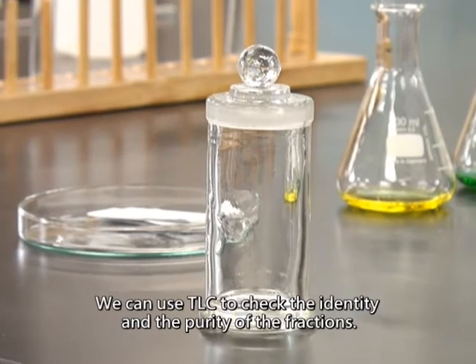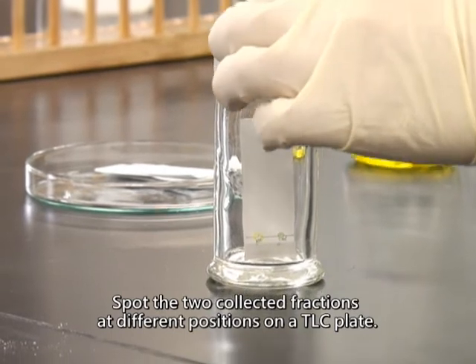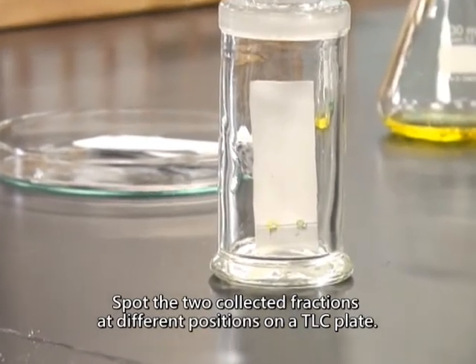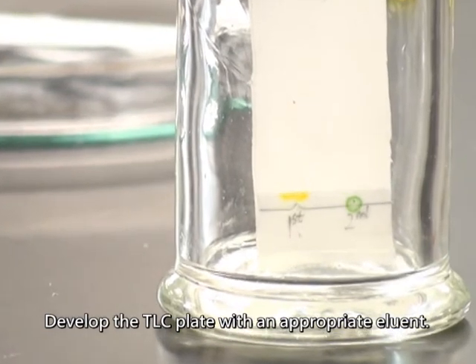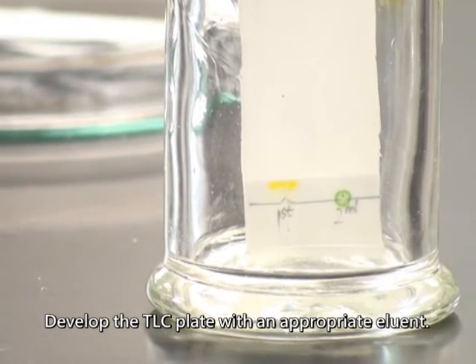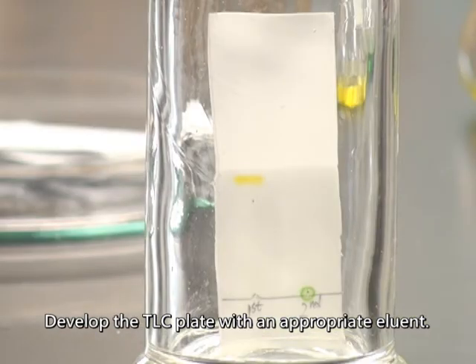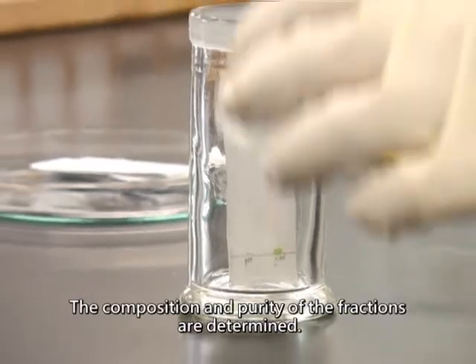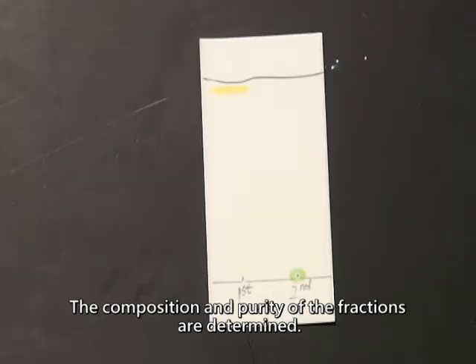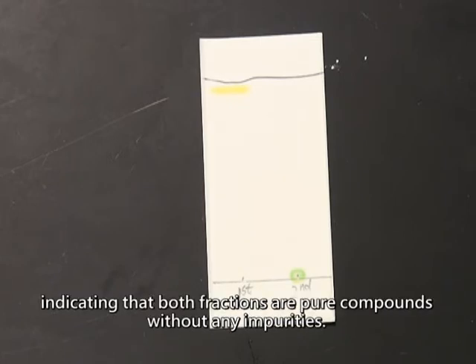We can use TLC to check the identity and the purity of the fractions. Spot the two collected fractions at different positions on a TLC plate. Develop the TLC plate with an appropriate eluant. The composition and purity of the fractions are determined. In a TLC analysis, the two color bands appear as single spots, indicating that both fractions are pure compounds without any impurities.